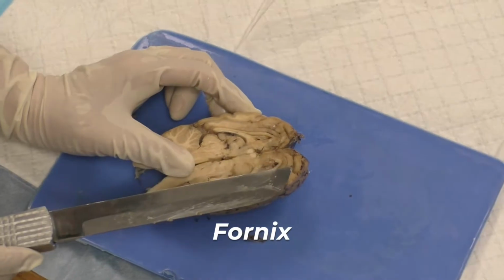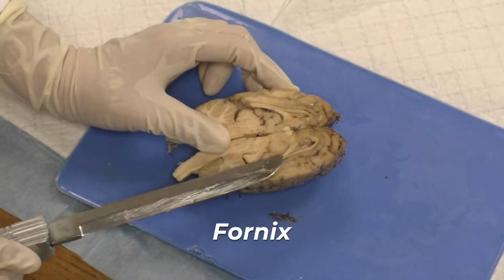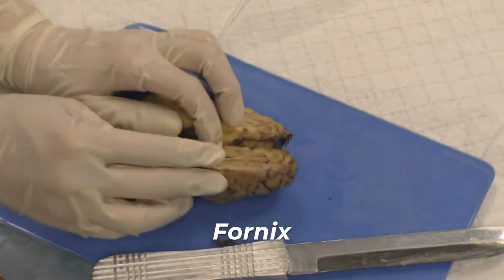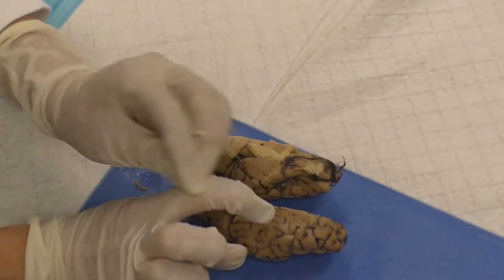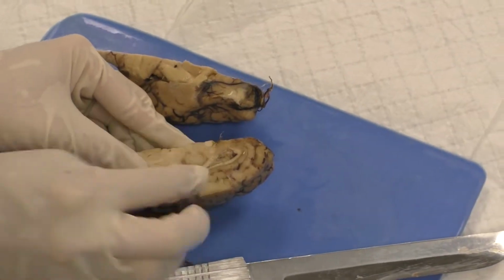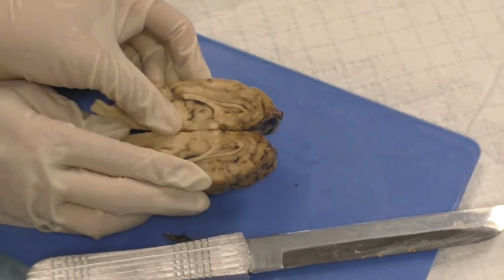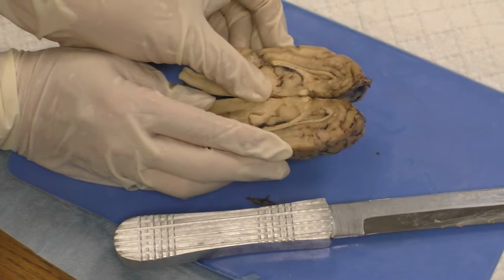The fornix is the output axons of the hippocampus. The hippocampus is right below this, sitting at the top. Remember I said it was a C? The top part is here, and all those fibers are coalescing together and diving down right there on both sides. So those are really prominent fiber pathways to understand.